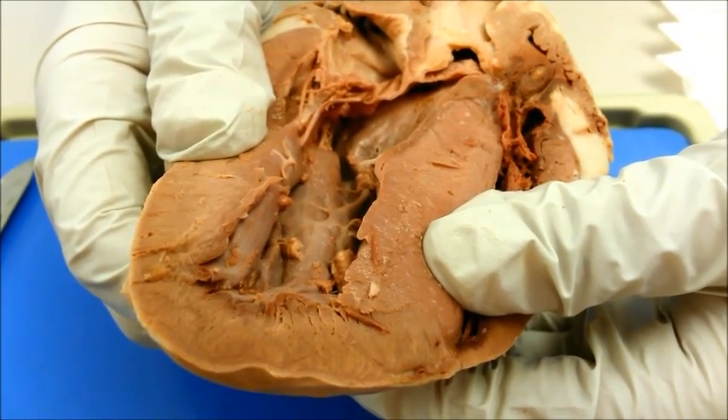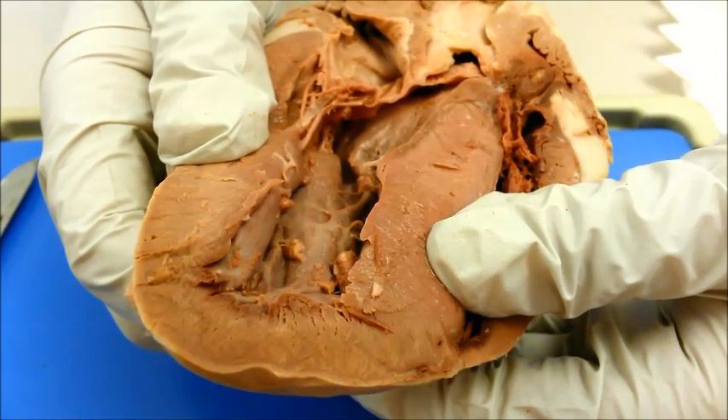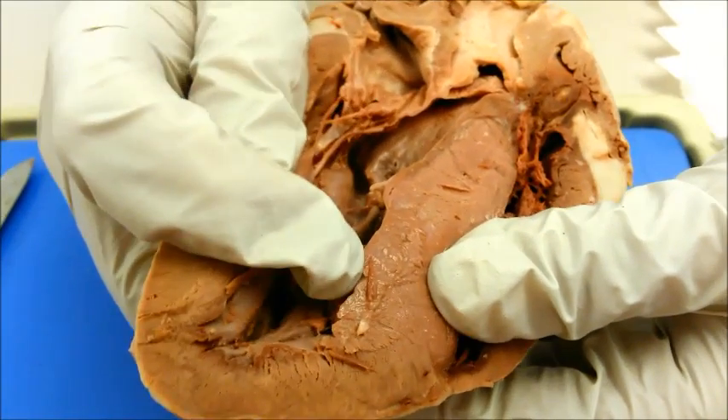Papillary muscles are muscles anchoring the chordae tendineae to the valves of the heart. These muscles work with the chordae tendineae to prevent the backup of blood.